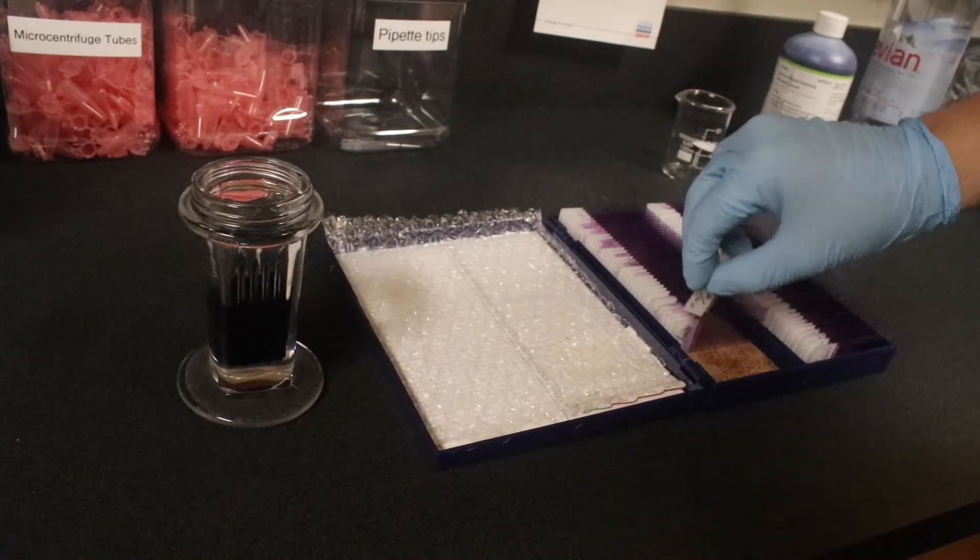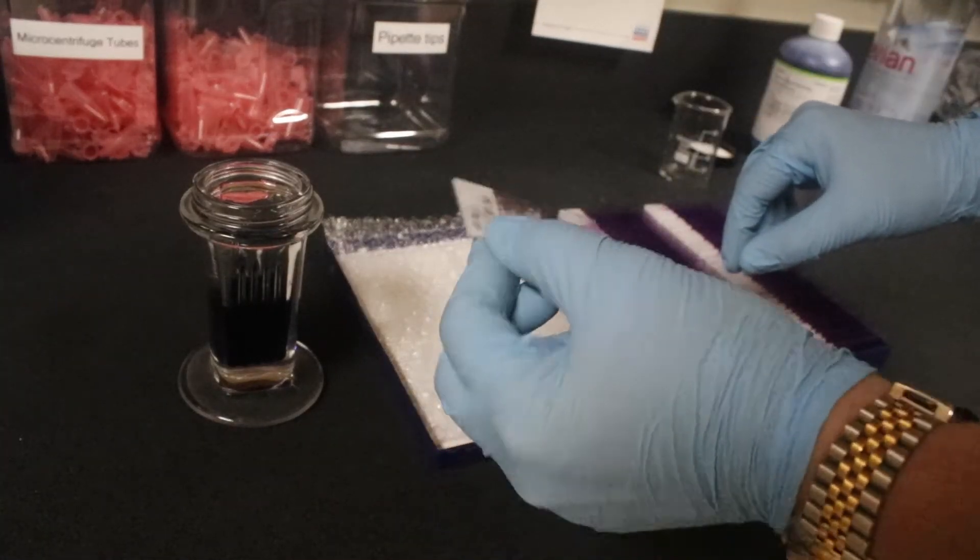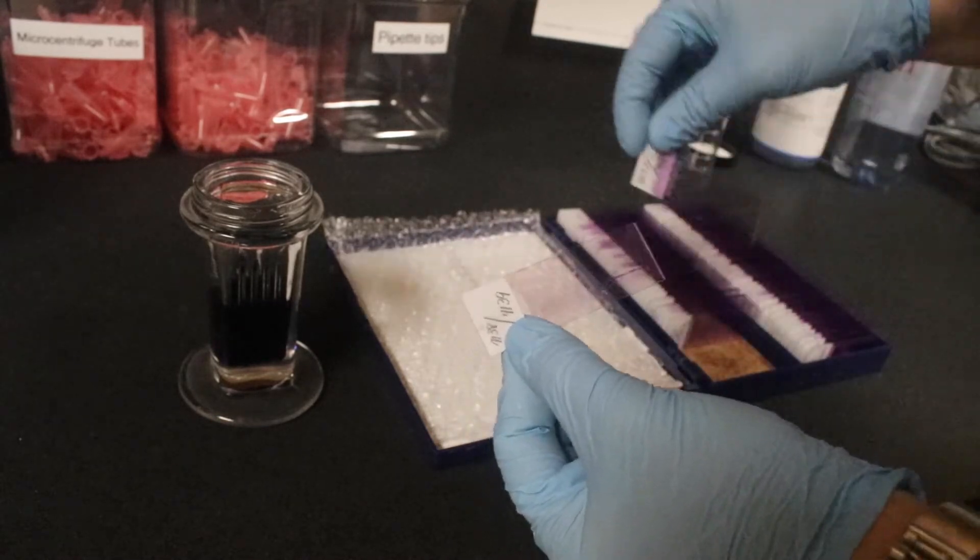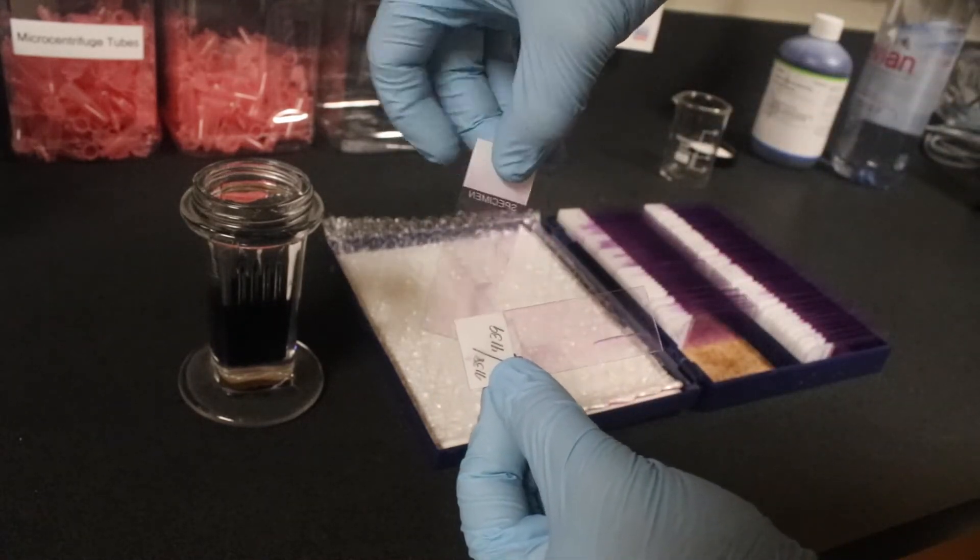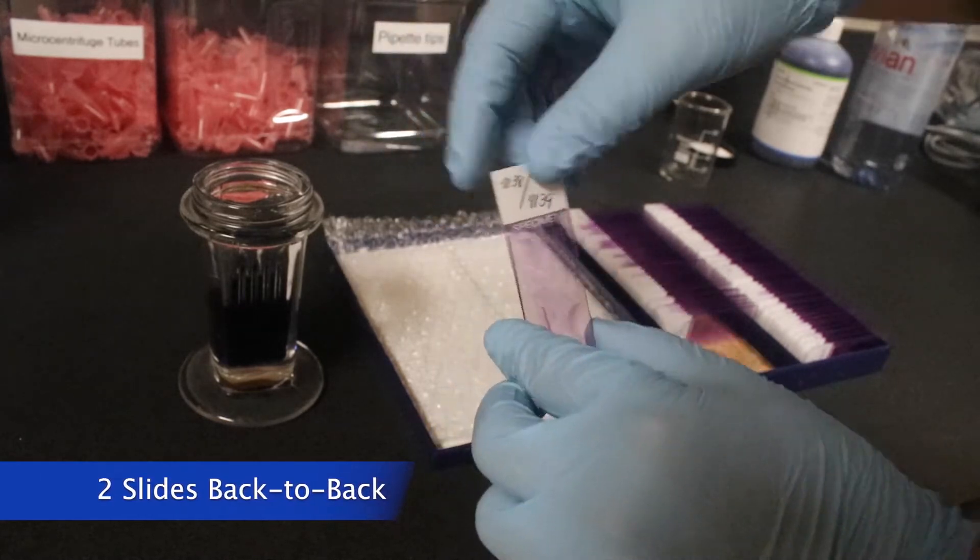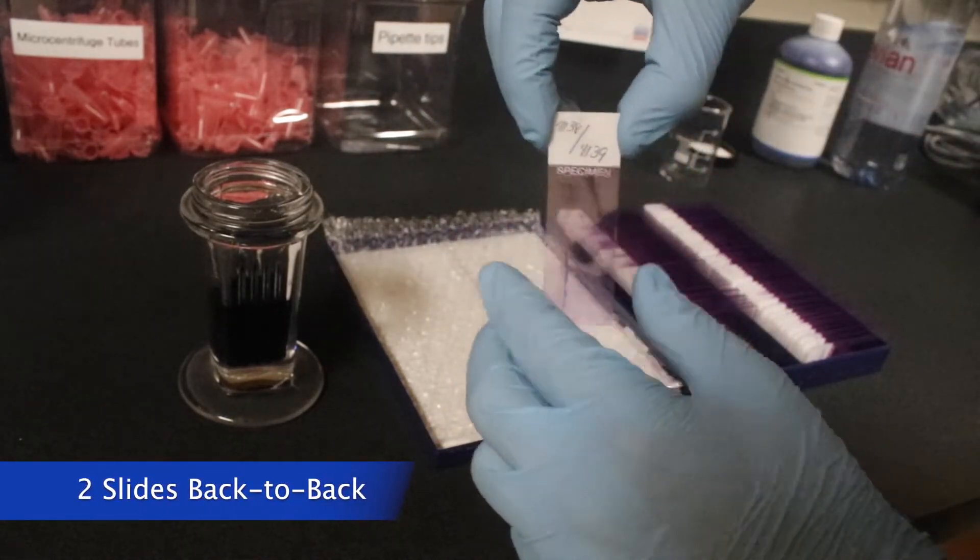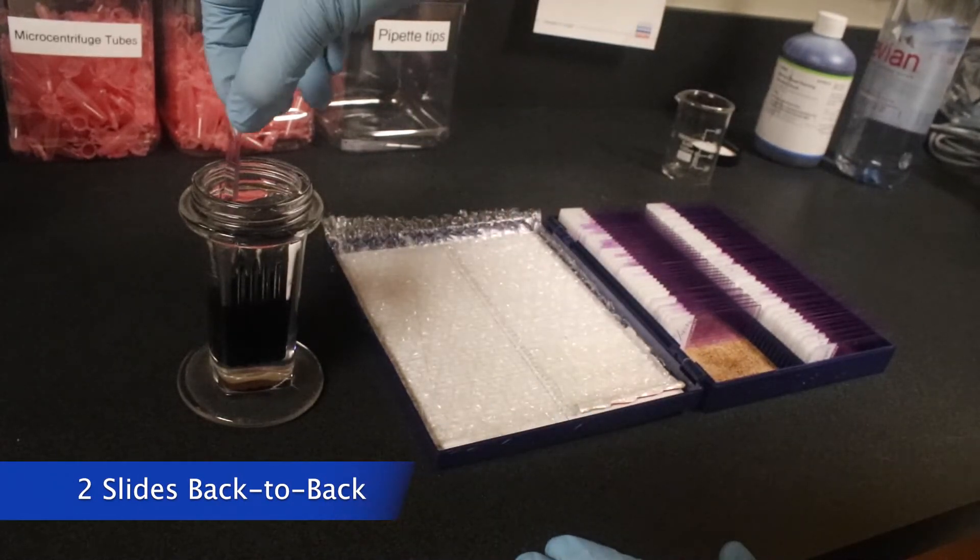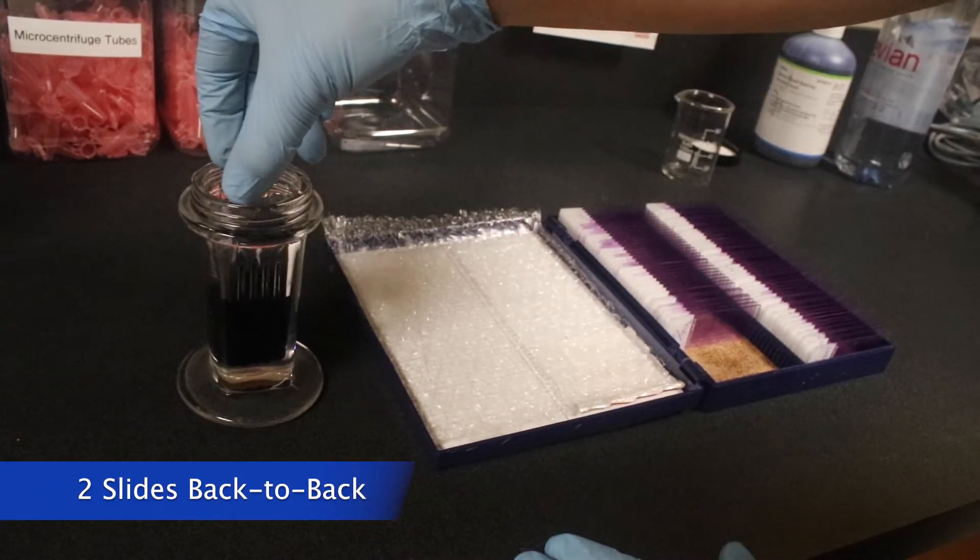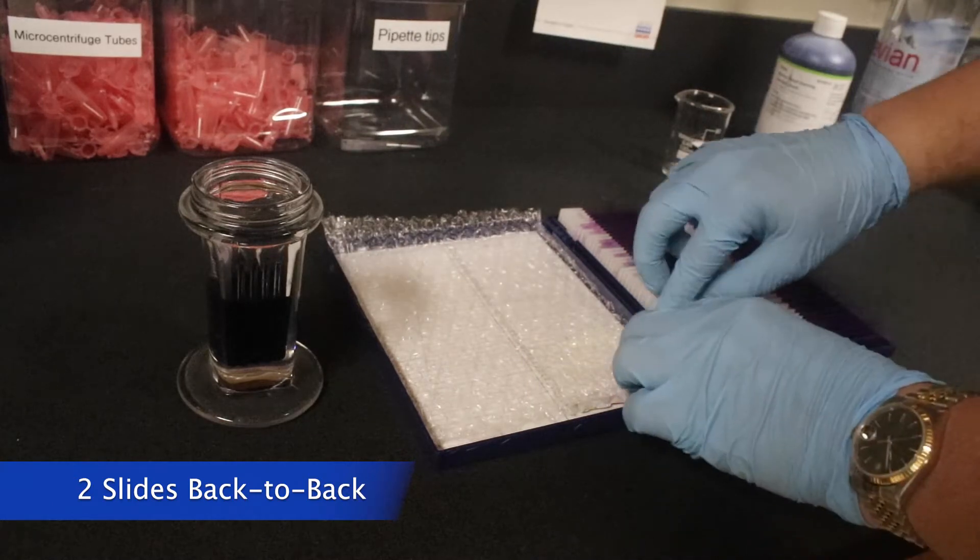After you mix the buffer water with the Yamsa concentrated stain, it's time to put in the slides. So, you can fit 10 slides in this Coplin jar, and the way we do that is putting them back to back. The Coplin jar has five slots, but each slot can fit two slides.